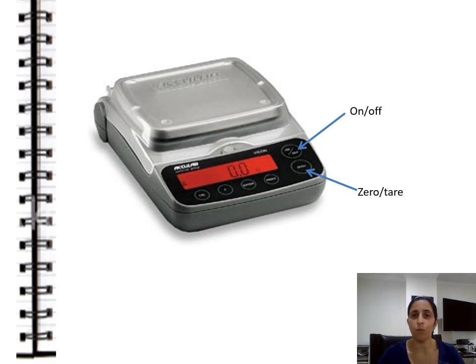Now, if I want to subtract the mass of the container I'm using, I just place my container on top of the platform and I press the tare button. Then the display will read 0. So the tare button subtracts the mass of your container for you automatically so that you don't have to do that yourself. It saves you an extra calculation.